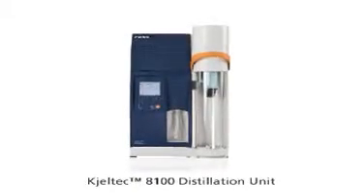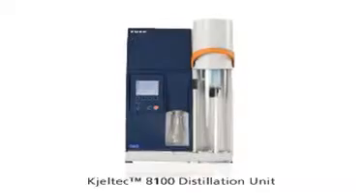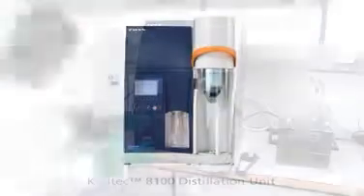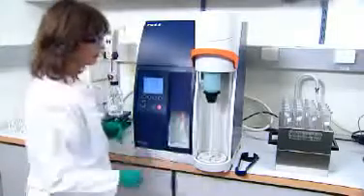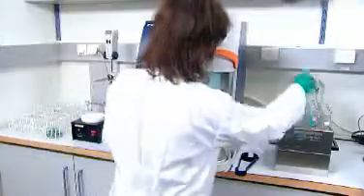The Kjeltec 8100 is an easy to operate system for the distillation of Kjeldahl nitrogen and other volatile compounds, built on the renowned accuracy, cost effectiveness, and safety of FOSS analytical solutions.